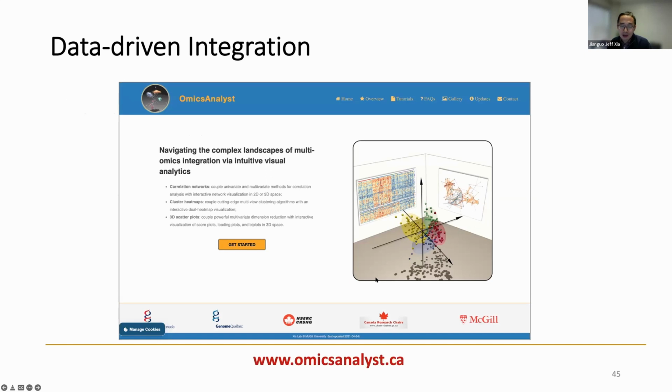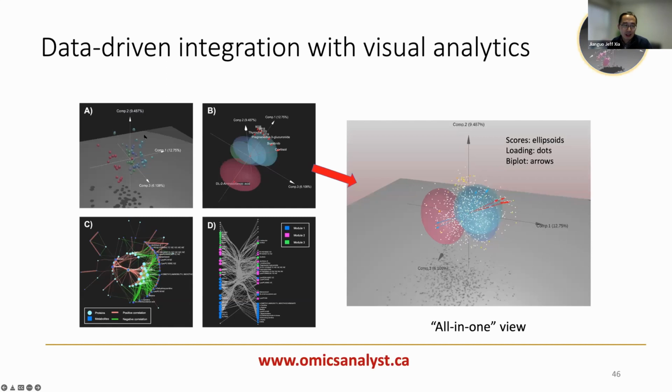This is another one, OmicsAnalyst, which we published last year, to directly upload the data tables from different omics. We can combine them. Again, we want to emphasize there's a virtual reality theme here. It is not virtual reality yet because we don't have goggles, but eventually, if technology allows, it will be there. You can see this is all implemented in 3D, and we have different multiomics. We integrate them together, and using dimensionality reduction and visualization, we can see which compounds drive the separation. Even though there are so many data points, if we just look at the patterns, like different colored bubbles and the main biomarkers in the loading plot, we will still see the main patterns and the main drivers.